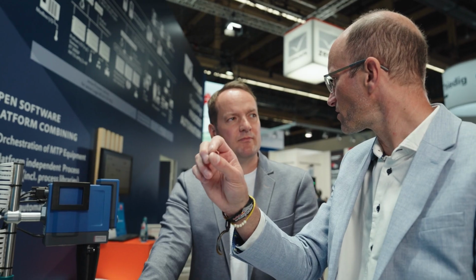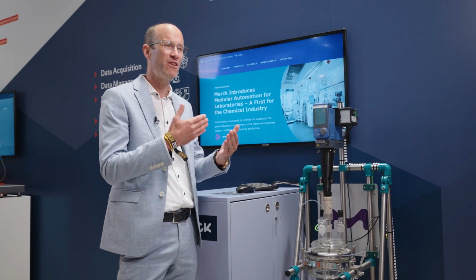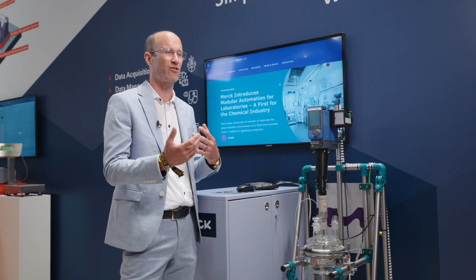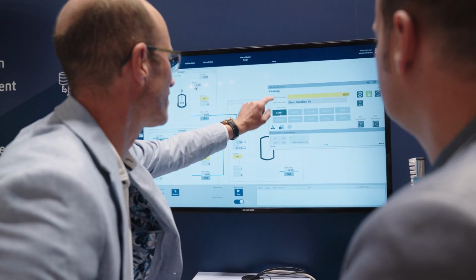What is not changing, and this is tremendously important, is that we have a lot of varieties of different kinds of products with a lot of needs from the customer and needs from the market. We have to be much faster to bring products to the market. So you need the possibility of being flexible and using different kinds of technologies. We see this in our environment, and we see this in the whole world. And from my personal job, it has changed because I'm a little bit of an ambassador of this technology, because I see that this is the potential for our future.